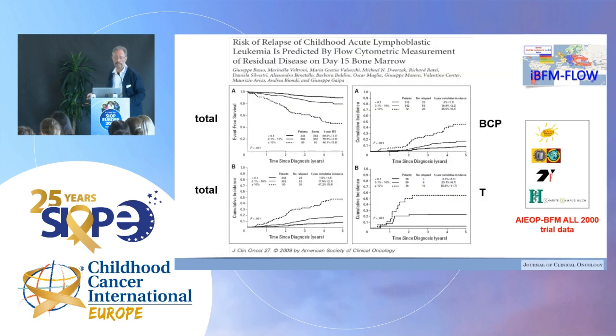And my late friend, Pepe Basso, from Padua, collected together with us a huge amount of samples, and nowadays this is the basis of all the IBFM trials with the day 15. Early in therapy, you already can separate 3 risk groups. Early in therapy, it's a, let's say, more or less easy test. You have the result within a day.